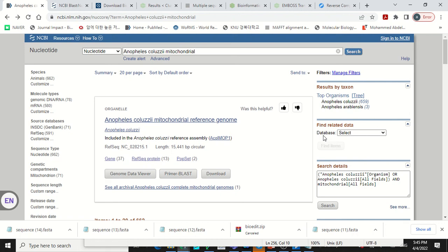Welcome back to the Anson session continuation. So now I am going to show you how to search, how to use the open reading frame using EBI. So I'm going to use my sequence as an example.